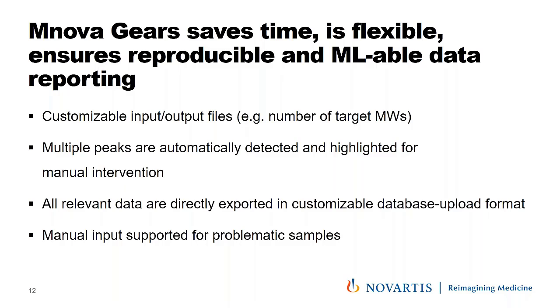The possibility to directly interact with the output file in the Mnova Gears platform and exporting all needed data in a database viable format minimizes the manual handling of Excel files, further reducing the danger of human error.